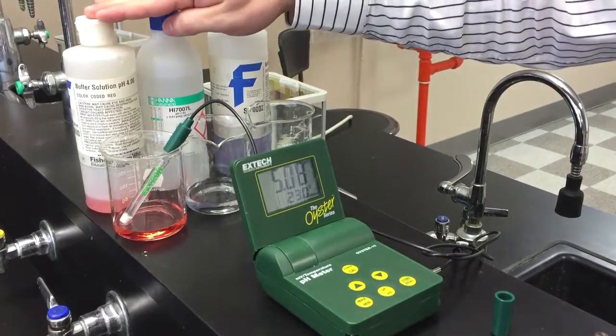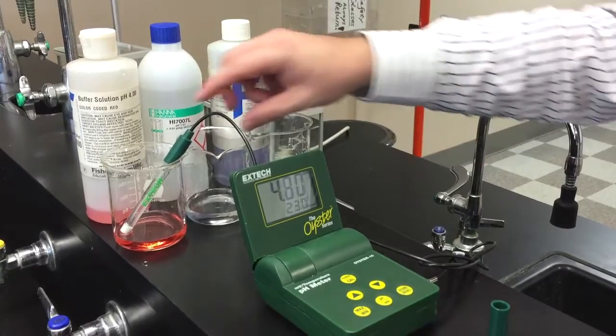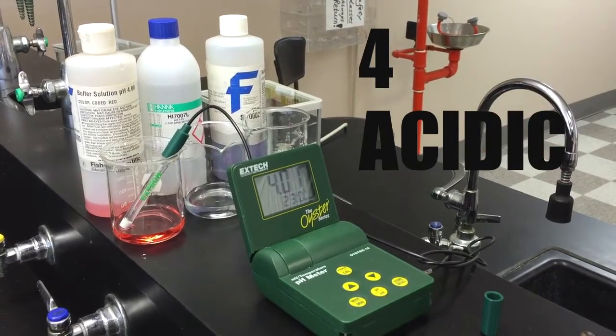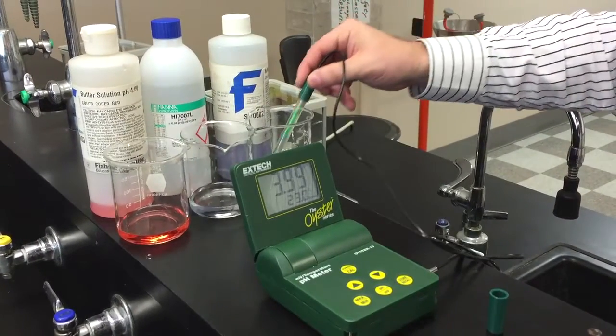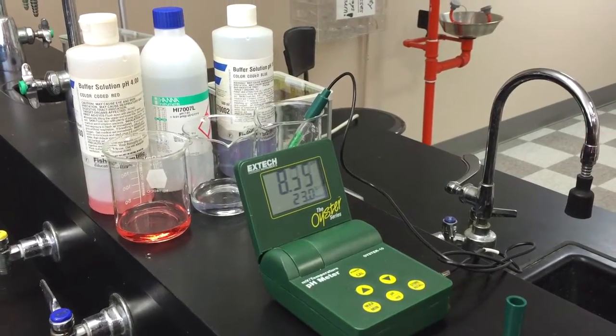Now we put it into a pH solution of 4, and it does take a little bit of time to go down as the electrons and protons are activating on the probe. So 4.02, 4.01 — we know with this one we're really accurate. Then we shake off the excess as we go to the next solution, this one being our pH of 10, kind of the alkaline range they're pushing for.